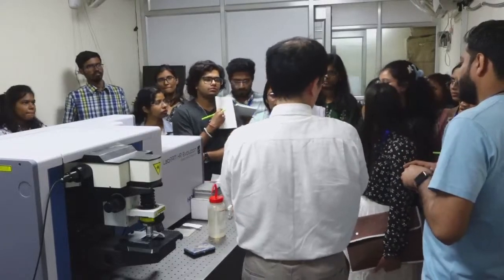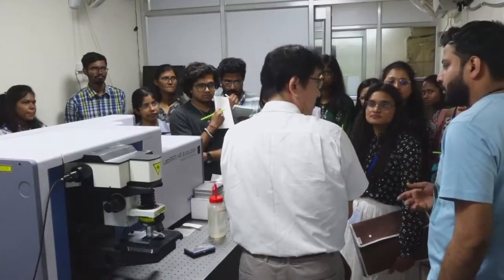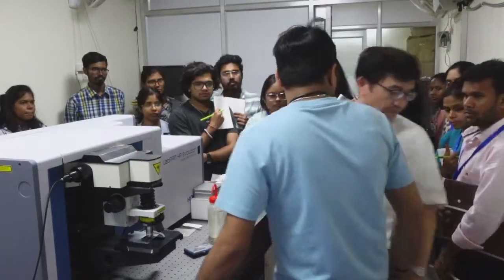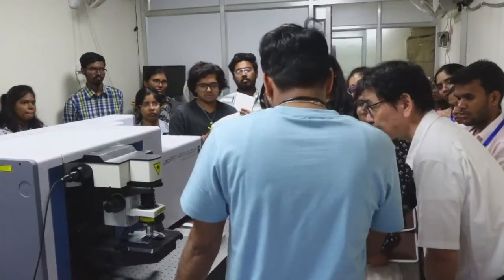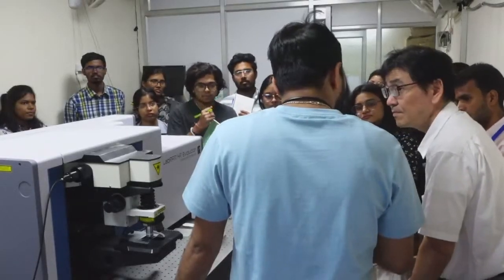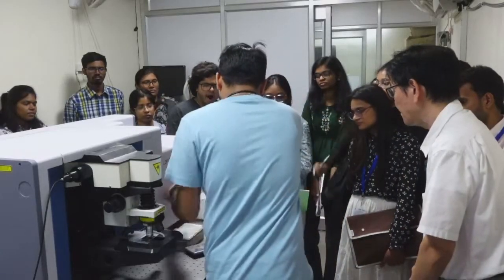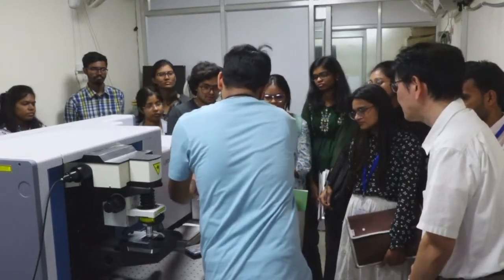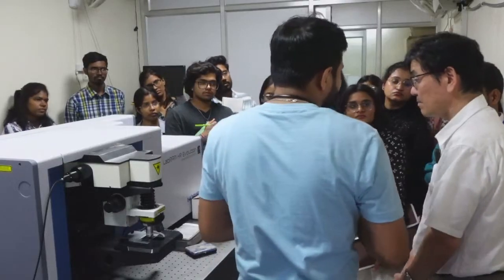Any other question? No, shall we move to measurement? So here we can do it for a liquid sample. There are two types of instruments. We can just drop the sample on the slide and take the measurement, or we can take the sample in the cuvette. So here we can put the cuvette. Which one will be better?